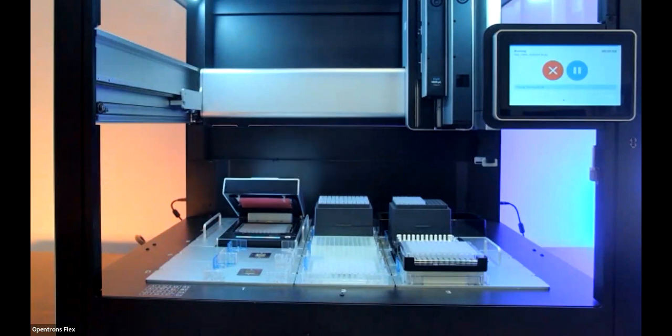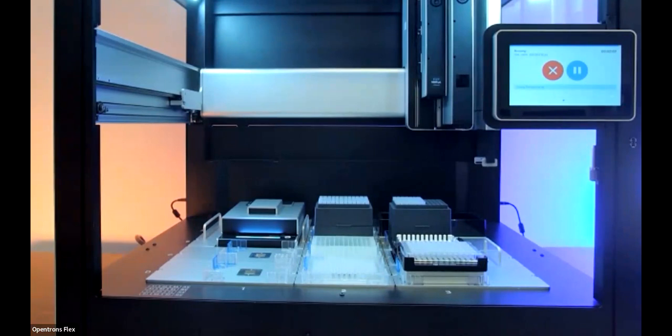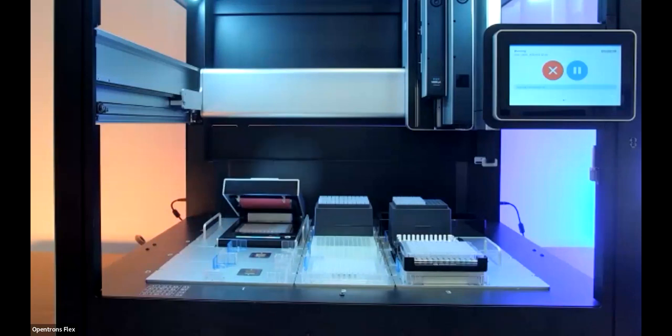Cool. Andreas, your question, how is the computer where you wrote the protocol connected to the robot to receive the protocol? That's a great question. A big thing in designing the Flex has been connectivity. Obviously, we want these instruments to be as easy to use as an appliance, ideally. The way that we thought about the Flex is giving people multiple options. Depending on the security situation in your lab, there might be some hard requirements on not connecting to the internet.